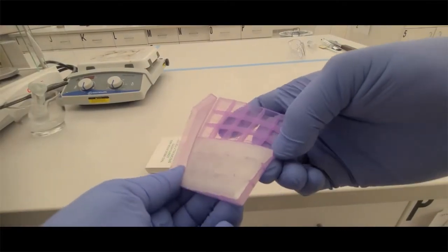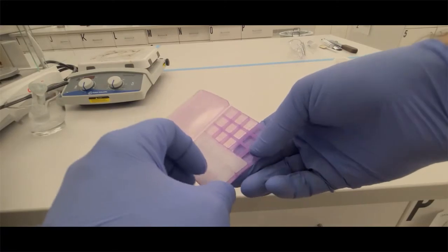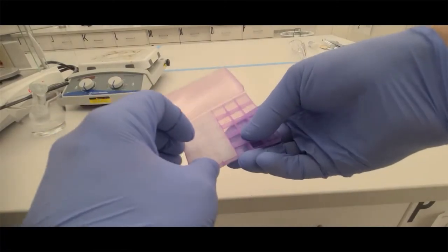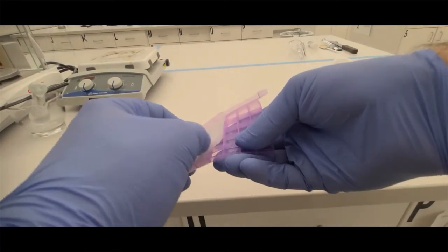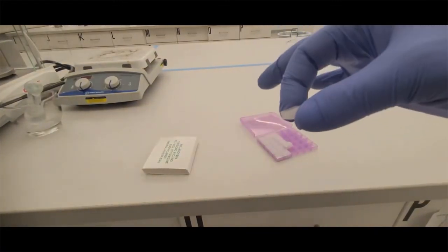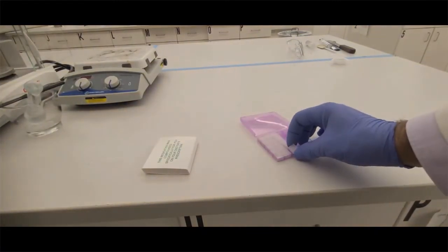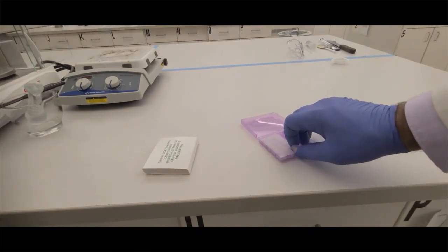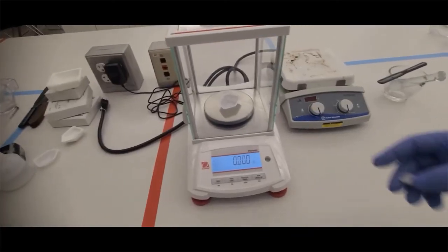To pop these out, it's almost like an ice cube tray. You sort of flex the plastic. And once you open up the plastic enough, you can get your finger and actually pull out one of the doses. The troches will have that design on top so you can do a quarter or a half. And then again, some people will put them upside down so that the cleaner side is facing up.